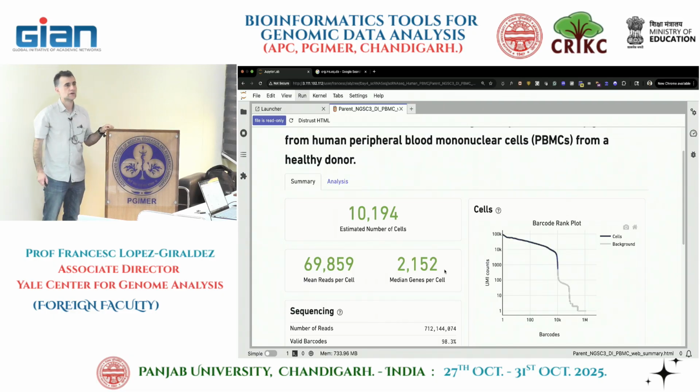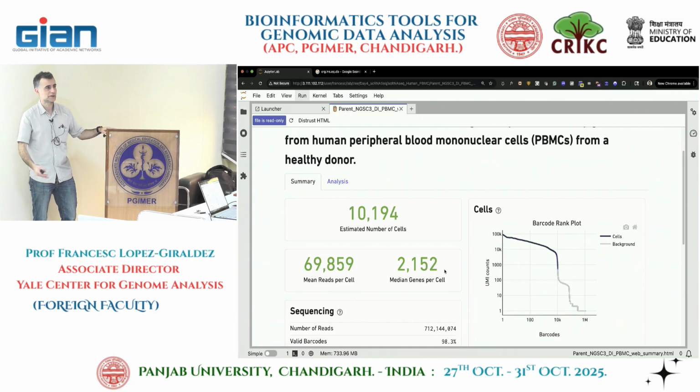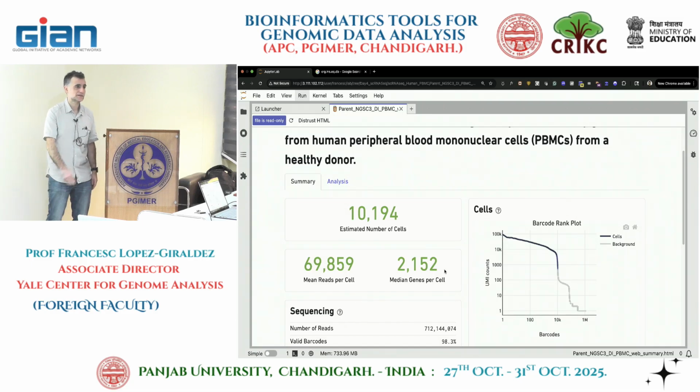What was I saying? Oh yeah, so we can recommend, if you come to the Genome Center, that you do an exploration analysis first to be sure that your data looks good. We're going to sequence less. And then they give you all the data back and say, oh yeah, you sequenced less, but I'm not able to do much of an analysis with it, right? The only thing I can check is that I have a convincing number of cells maybe. Although this number also depends on this and how well you build this curve.